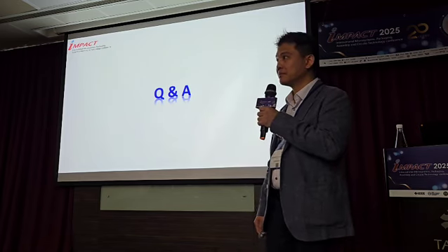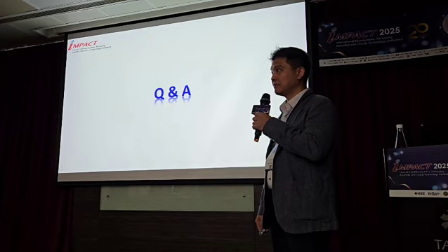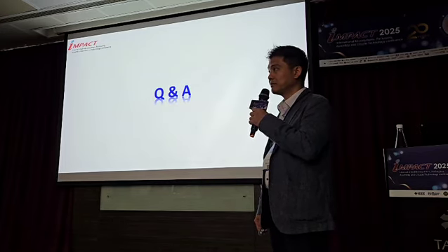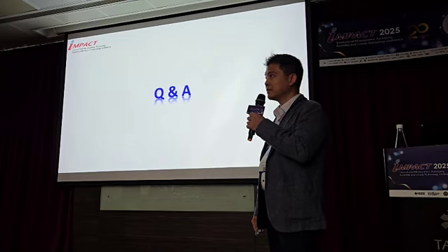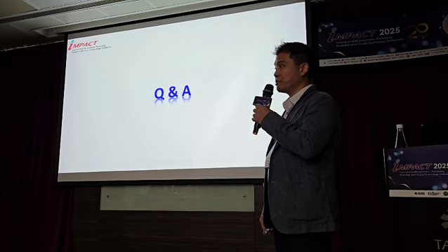So in terms of the element detections or some molecular detections, should we be required to prepare, for example, micro joints through a cross-section process first, and then use your detectors? It depends on the sample geometry that you're looking at.